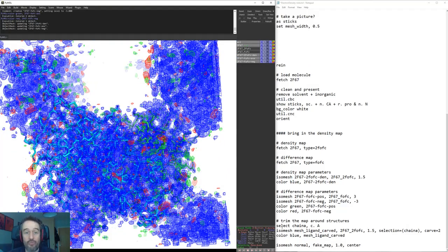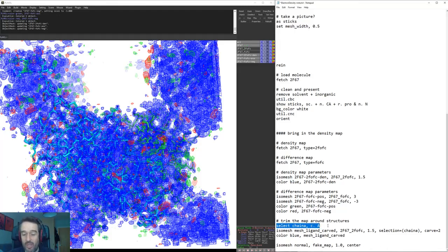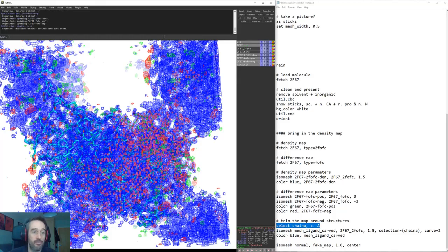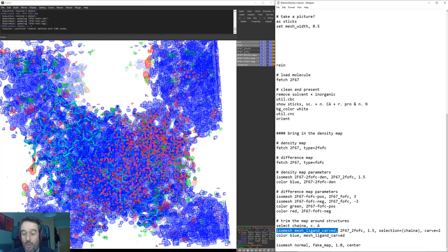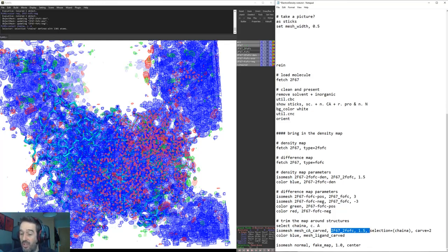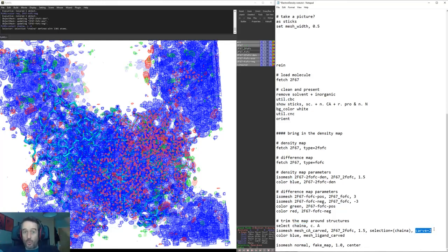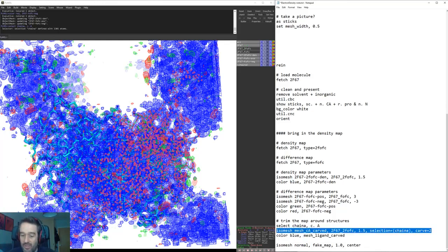In order to do that the first thing that we need to do is to make a selection. So here I'm just going to select chain A as an example. Then what we can use is our isomesh command again, make a new object called mesh chain A carved, and it's going to be our 2FOFC map which is going to be displayed at 1.5 sigma around our selection chain A which we have just defined here. Then we're going to carve a two angstrom zone around the atoms that we're interested in.